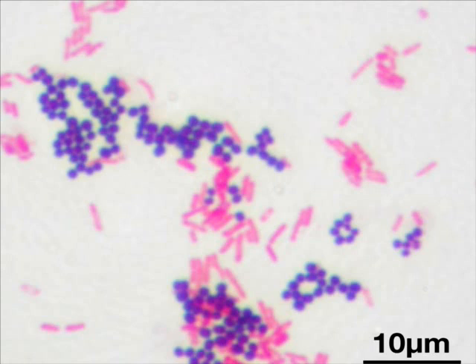So under color you can write as violet. The other organisms are pink in color. So under color you can write violet, pink in color. Now regarding the shape, you can see the violet color organisms are spherical, so they can be called cocci. The pink color organisms are rod shaped, so they can be called bacilli.